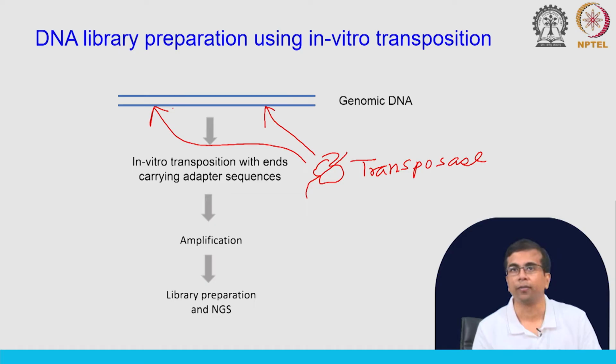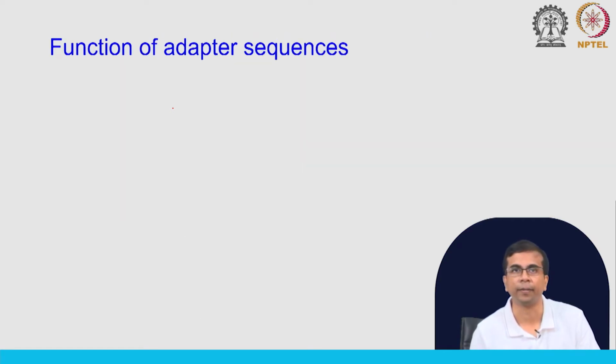So, you can have this library preparation step, which again could be specific to the platform. Okay. So, you can use these two methods, right. You can also do this transposase method. In some cases, this probably might be the only solution that you have.